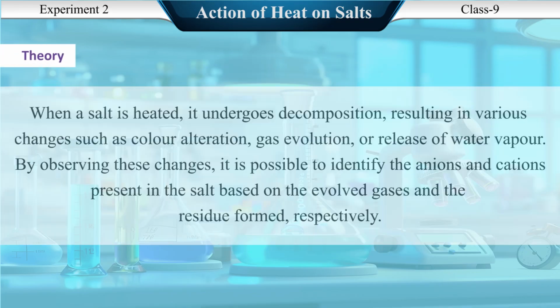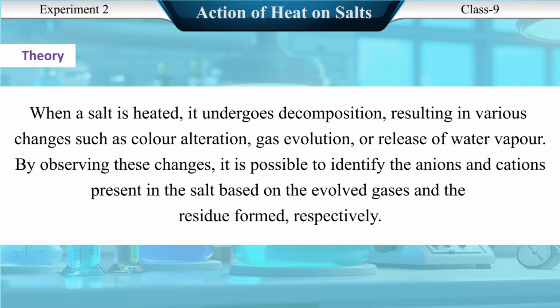Theory. When a salt is heated, it undergoes decomposition, resulting in various changes such as color alteration, gas evolution, or release of water vapor. By observing these changes, it is possible to identify the anions and cations present in the salt based on the evolved gases and the residue formed respectively.